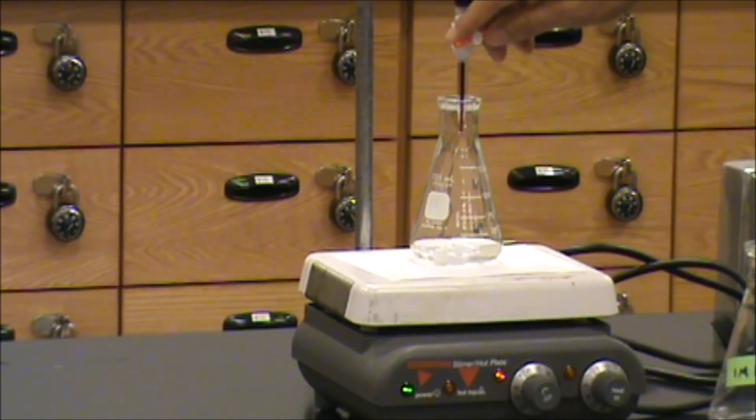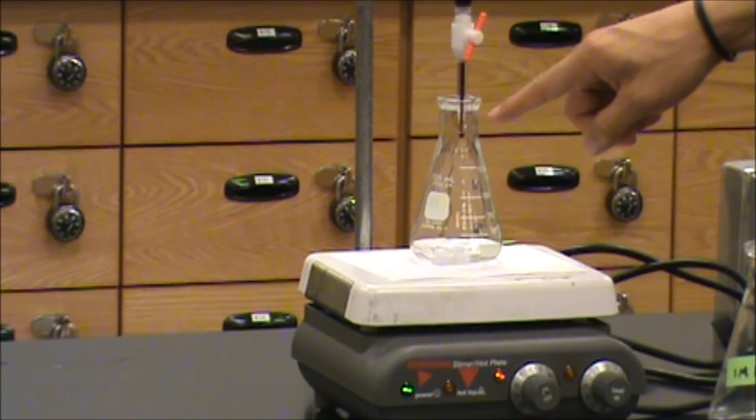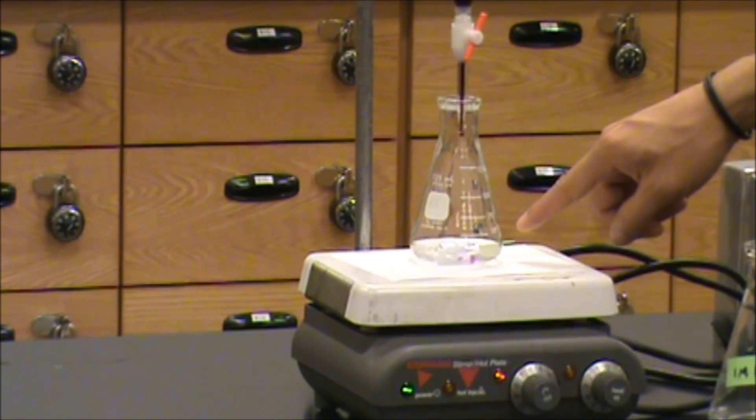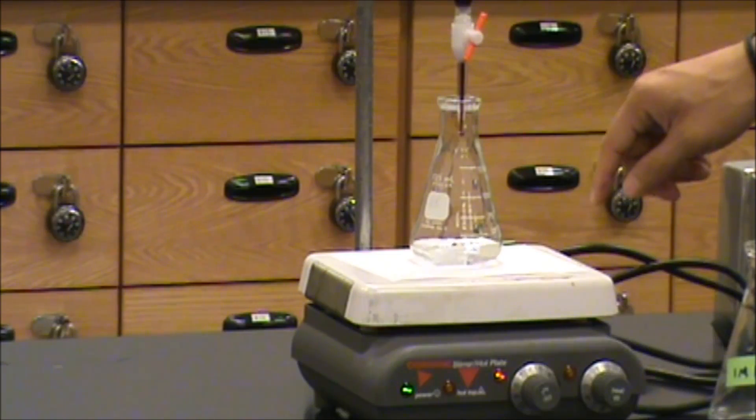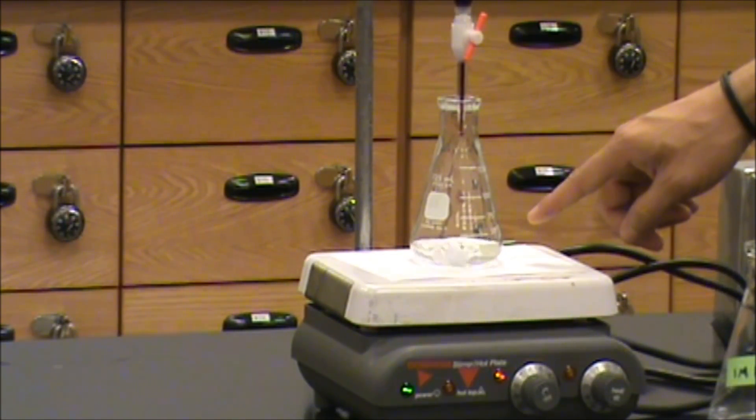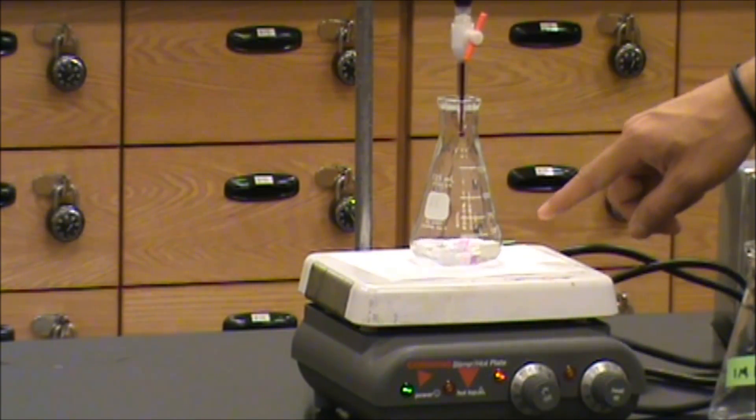I'm now going to turn the stopcock to begin addition of the titrant. And what you'll note is that the purple color rapidly dissipates upon hitting the solution as it reacts with the peroxide. You may also be able to see bubbles of oxygen forming as oxygen is one of the products of this reaction.